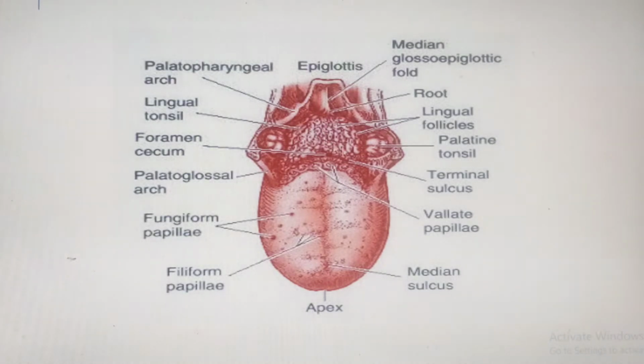And then beyond that, before I get to the body, or the oral portion, which forms the anterior two-thirds of the tongue, what I see is that there's a primitive sulcus over here, which we call the sulcus terminalis. Now, ventral to the sulcus terminalis, we see this V-shaped area. Okay, and these are the vallate or circumvallate papillae. Circumvallate papillae, very important.